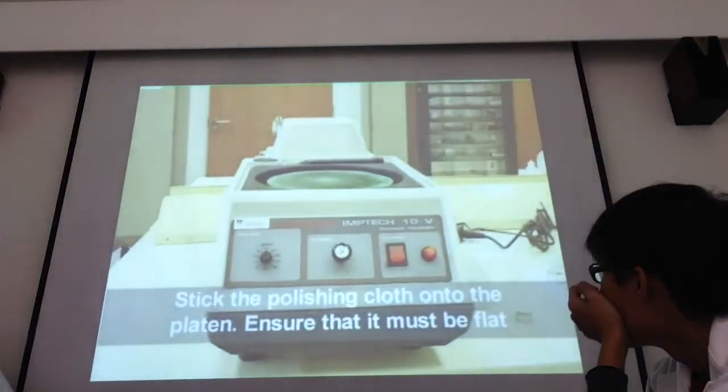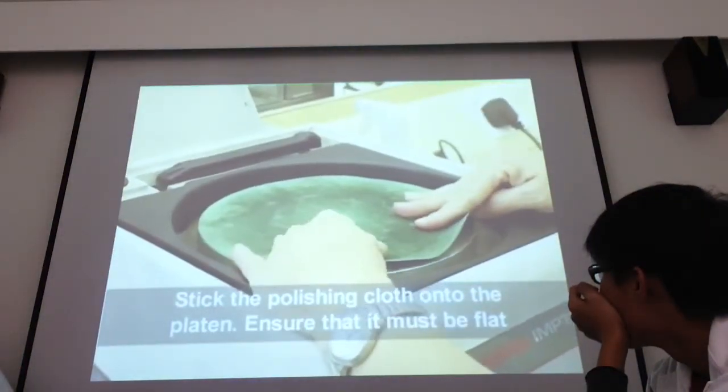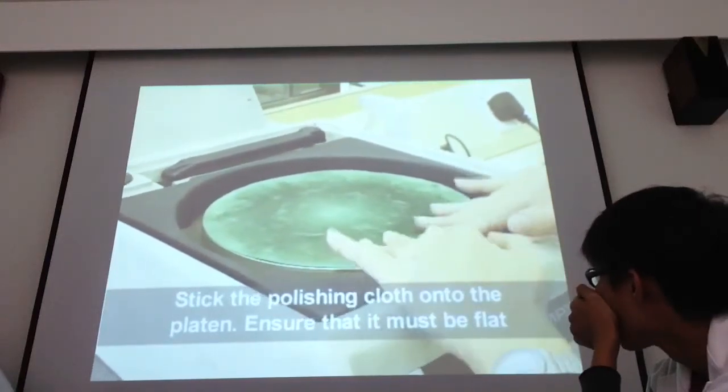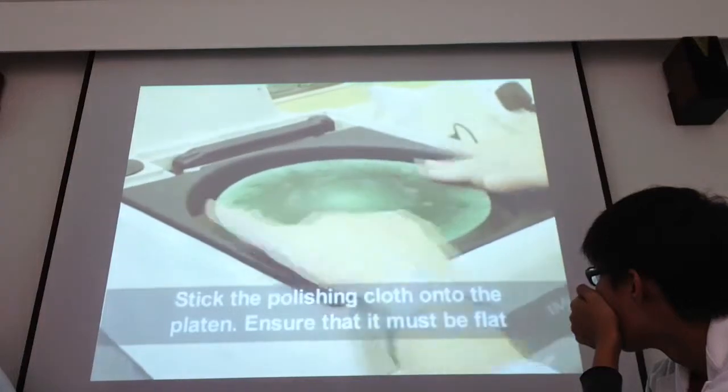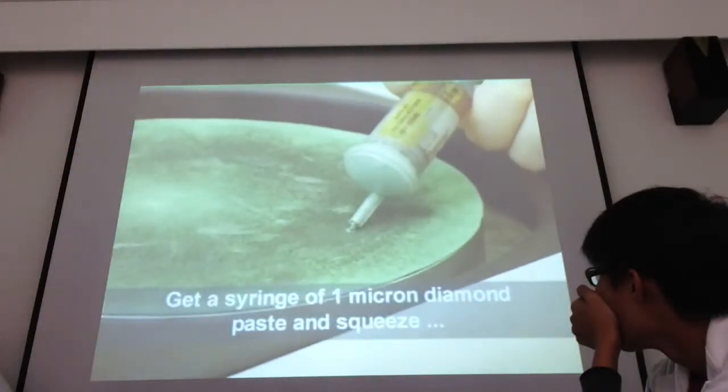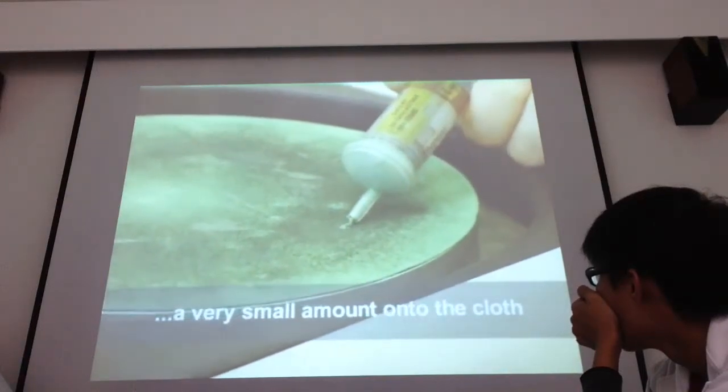So here's the polishing part. Same, you have to place a polishing cloth. Ensure that it's flat. And use some diamond paste, a little bit will do.